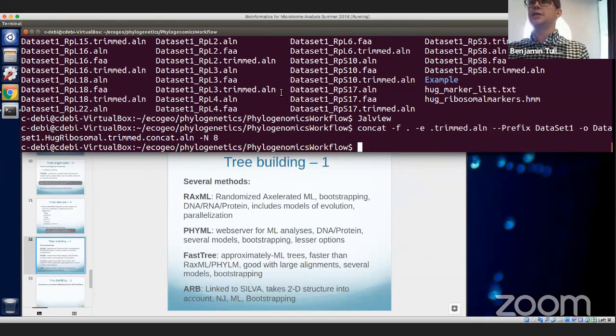If you're using it to get some general information, in this case some general relationship so we can assign some name to some unknown organism, or it's your first attempt to find out if your alignments or your sequences are related to each other, FastTree is awesome because it's fast. It's just the way it is.